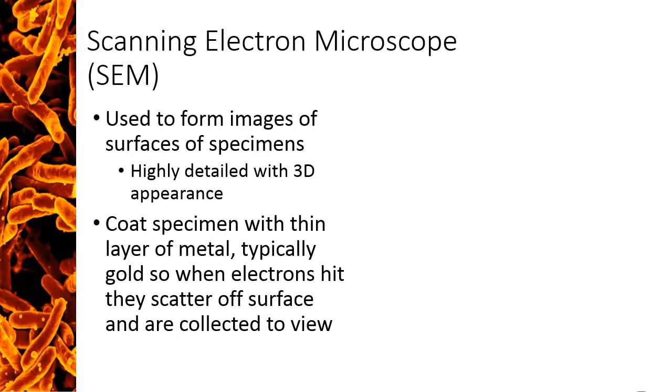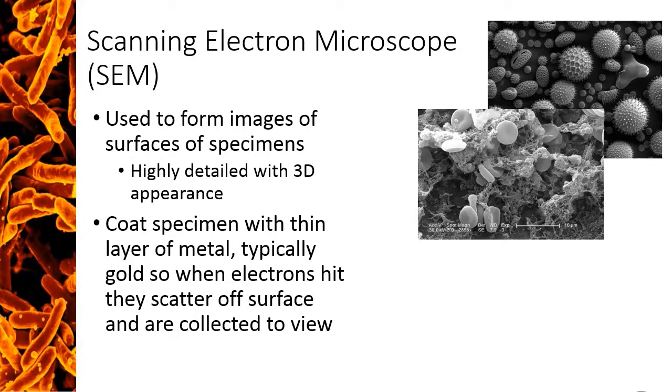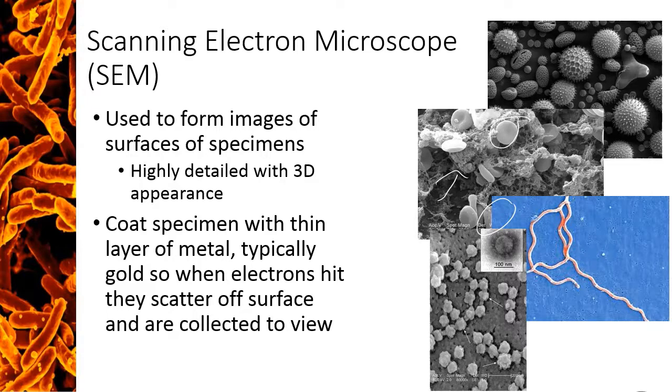Here we'll look at some examples of electron micrographs from an SEM. In this image, we see pollen grains of various shapes and sizes. This one is a blood clot. You can actually see the fibrous clotting material here with embedded red blood cells spread throughout it. This is a spirochete. This is actually Borrelia burgdorferi, which is the causative agent of Lyme disease. And this last image is the infamous SARS coronavirus that we're currently hearing so much about. We can actually see the spikes as little lumps along the surface of the virus itself. These spikes have been talked about a lot in the news because of their role in attachment to cells and their importance for vaccine development.